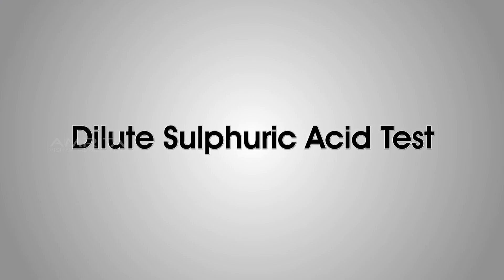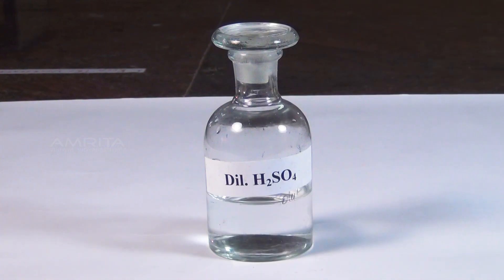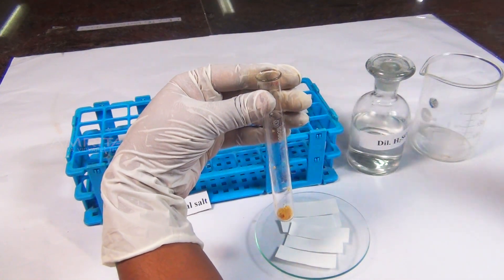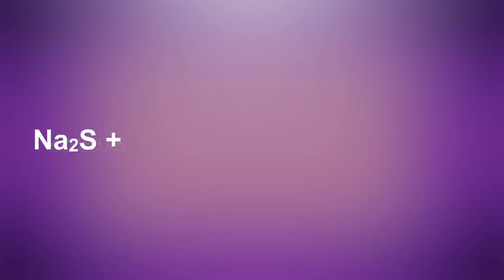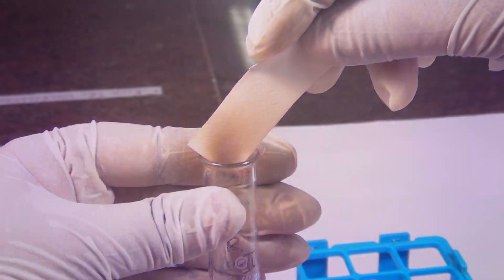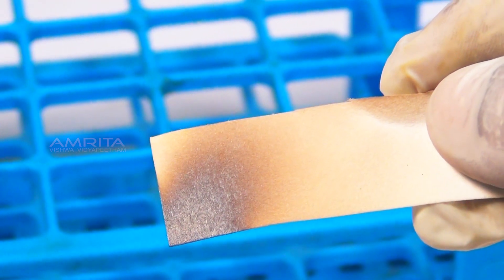Dilute sulphuric acid test. Materials required: original salt, dilute sulphuric acid, lead acetate paper, test tube, and a dropper. Procedure: Take a small quantity of salt in a test tube and add a small volume of dilute sulphuric acid using a dropper. Sulphide reacts with dilute sulphuric acid to evolve colourless hydrogen sulphide gas which smells like rotten eggs. Bring a lead acetate paper over the mouth of the test tube. Hydrogen sulphide reacts with lead acetate to form lead sulphide, which turns the lead acetate paper black.